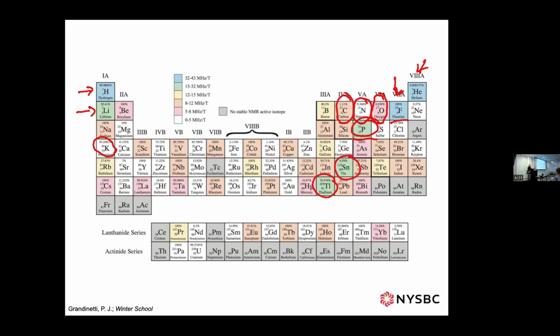So how do we think about this? I didn't really talk about it too much, but it's a very common thing in the field to do DFT calculations on quadrupolar nuclei and study them that way. It's one of the additions, other than multiple fields, to help you fit your spectra: run DFT.